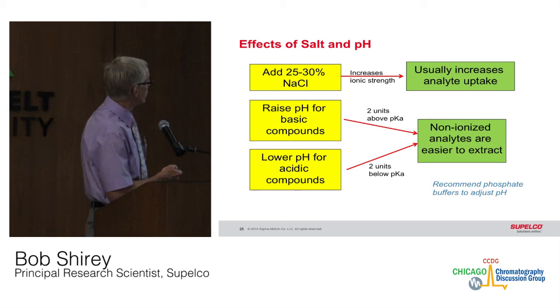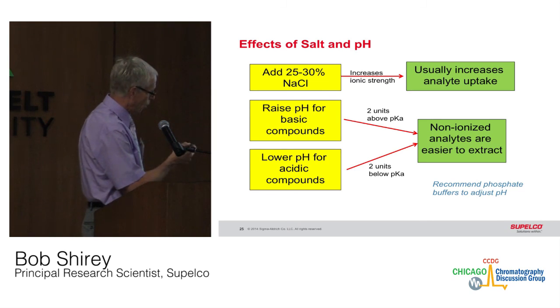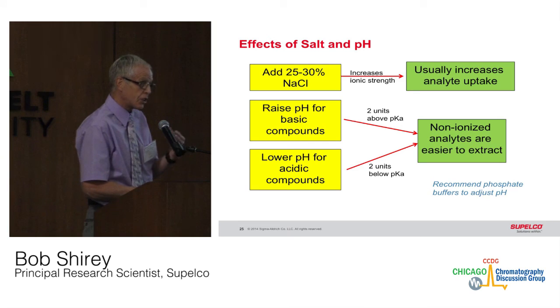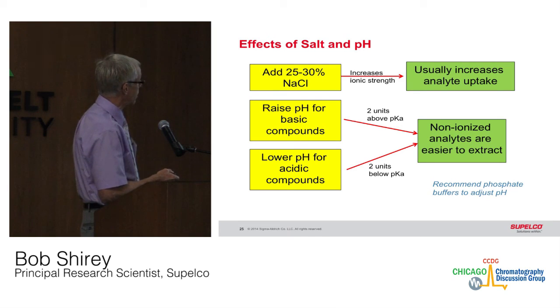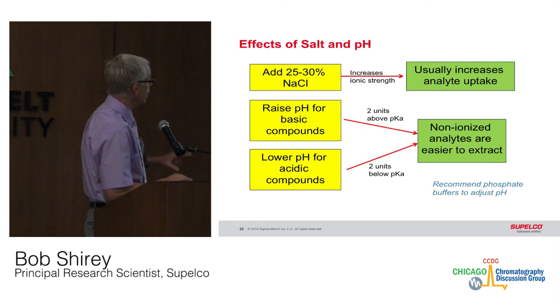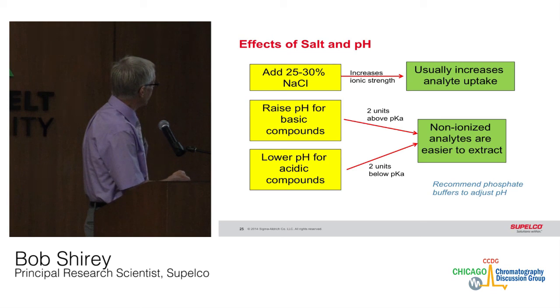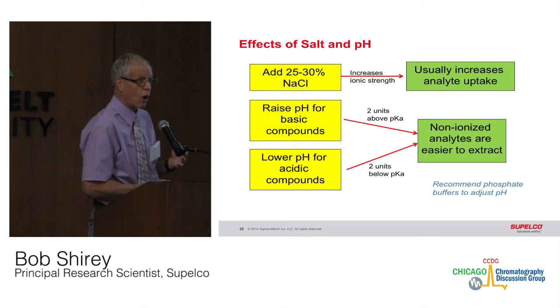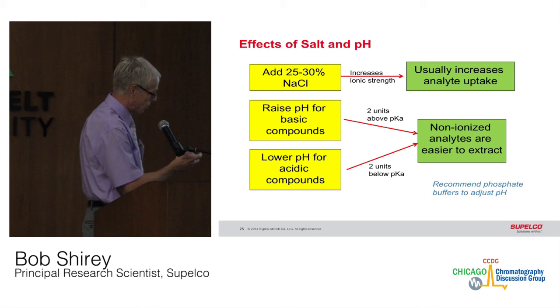Now the effects of pH and salt are shown in this slide. In many cases, if you're extracting polar analytes, you want to add 25 to 30% sodium chloride. This increases the ionic strength and usually increases analyte uptake. I say usually. For non-polar analytes, it could be detrimental because it may force them out onto the walls of the glass vial. When you're extracting bases, you want to be 2 units above the pKa if possible. That's not always possible, but it puts them in the non-ionized mode. The same with acids. You want to be 2 units below the pKa for acidic compounds. Non-ionized analytes are less soluble and more volatile, which makes them easier to extract.